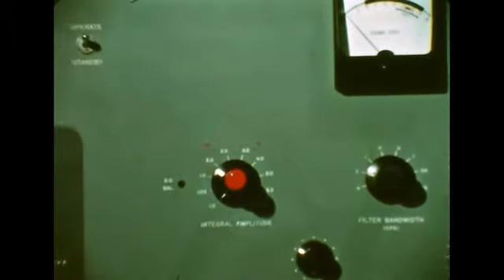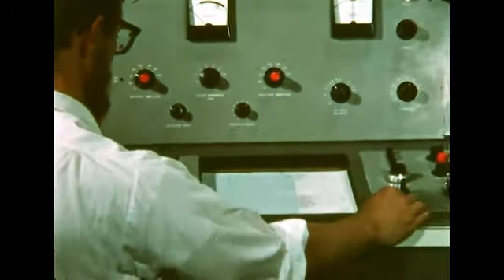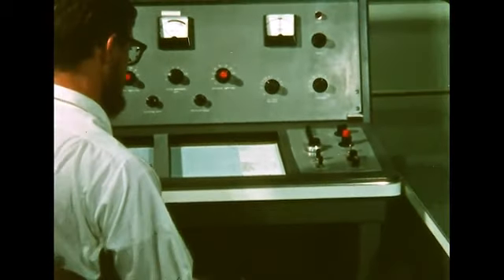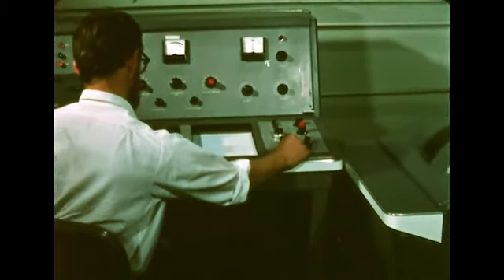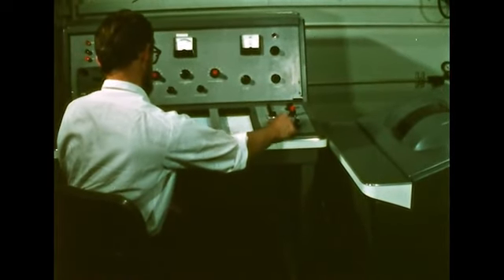We have mentioned only a few applications of NMR. In addition to structural determinations, NMR is increasingly used in qualitative and quantitative analysis and in the study of kinetic processes. In the short time since it was introduced, NMR has become indispensable to the chemist.